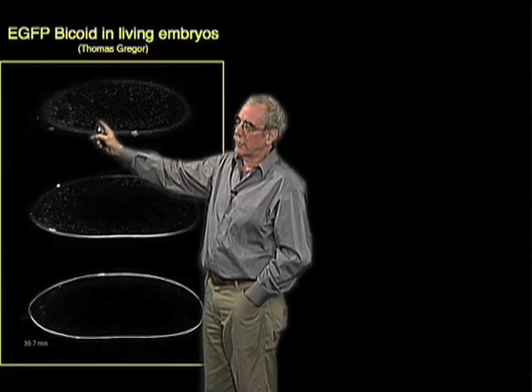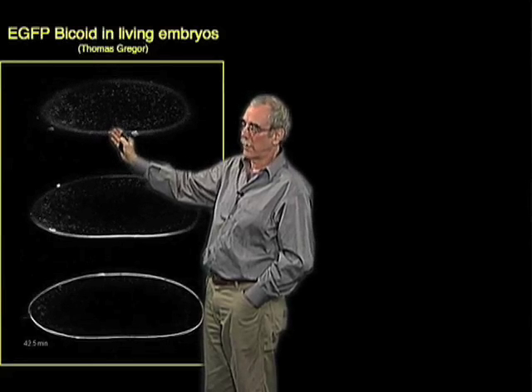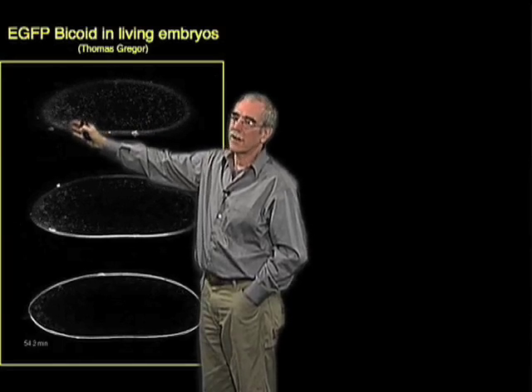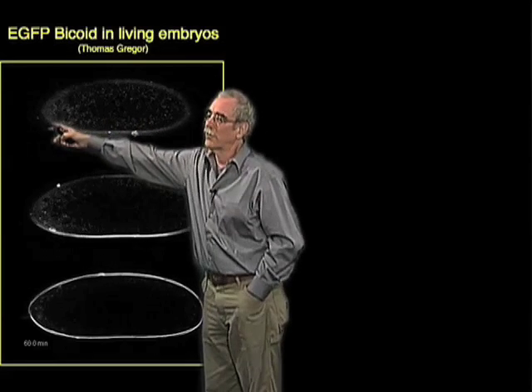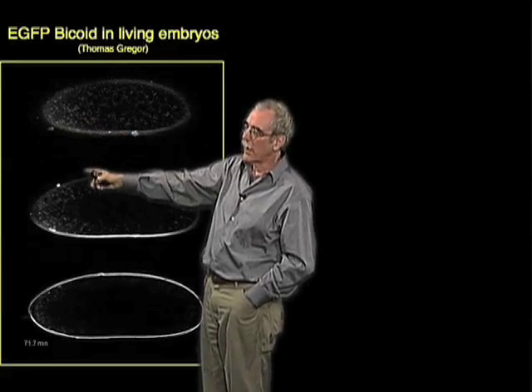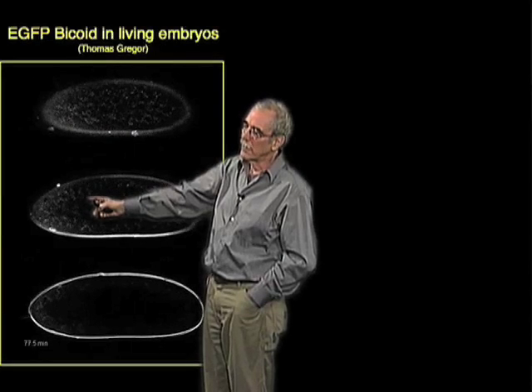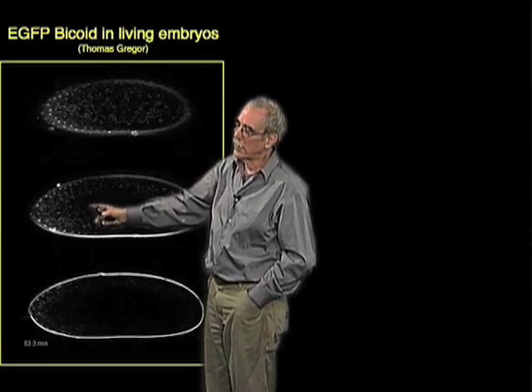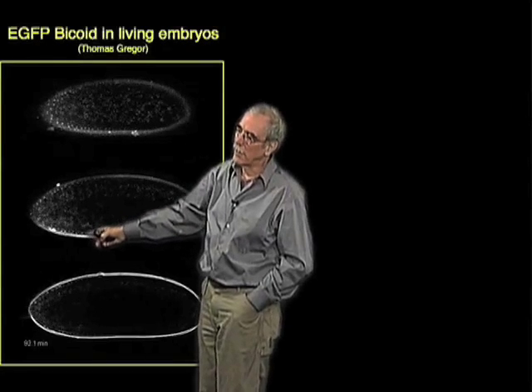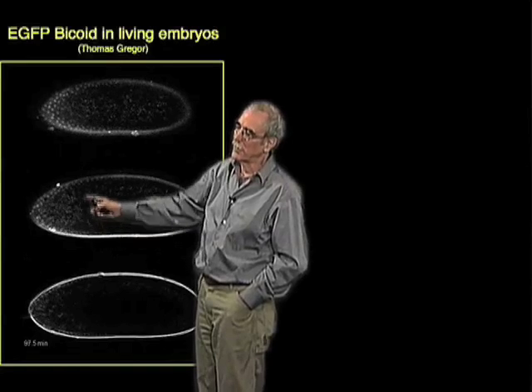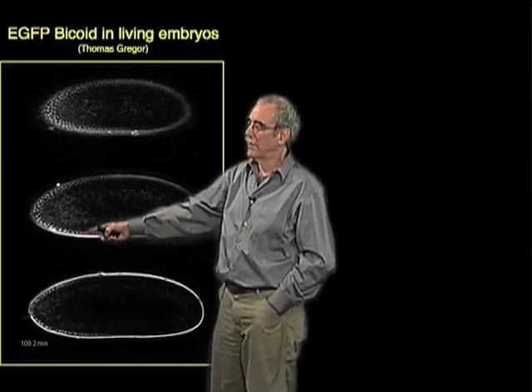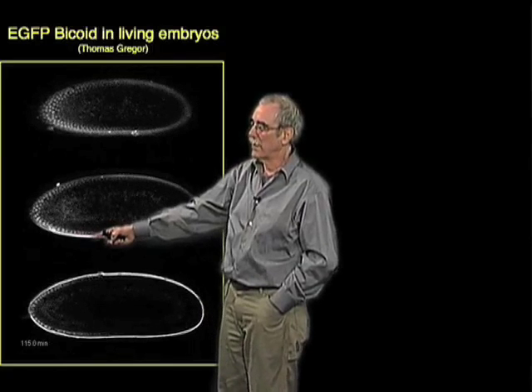In the embryo immediately after fertilization, you can see some movement in the cytoplasm. What you can't see yet is an obvious difference in fluorescence concentration between the anterior and posterior ends. But over the 2-hour period, as the nuclei make it out to the surface, you can see the accumulation of bicoid in nuclei at the anterior end of the egg.